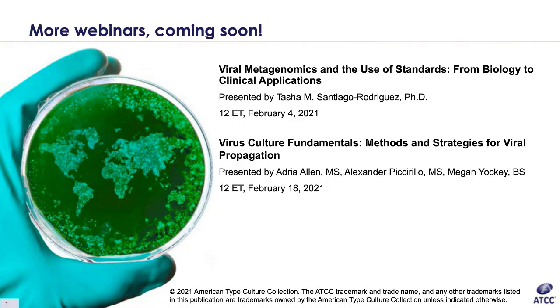At which point, when you take it out and that nitrogen starts to turn into a gas again, it could cause explosions of the vials, simply put. So it's more of a safety thing, but it should be cold enough both in the vapor phase and submerged for cells to be stored for a long time, but definitely try to keep it at the vapor phase.